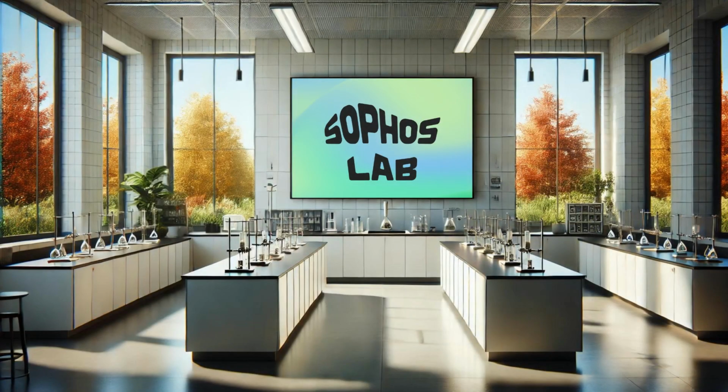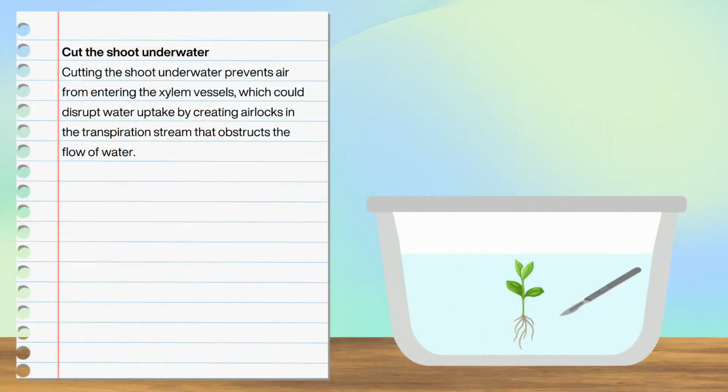Now, let's go over some of the key steps of the practical and their importance. Firstly, we cut the shoot underwater to prevent air from entering the xylem vessels, which could disrupt water uptake by creating airlocks in the transpiration stream that obstruct the flow of water.